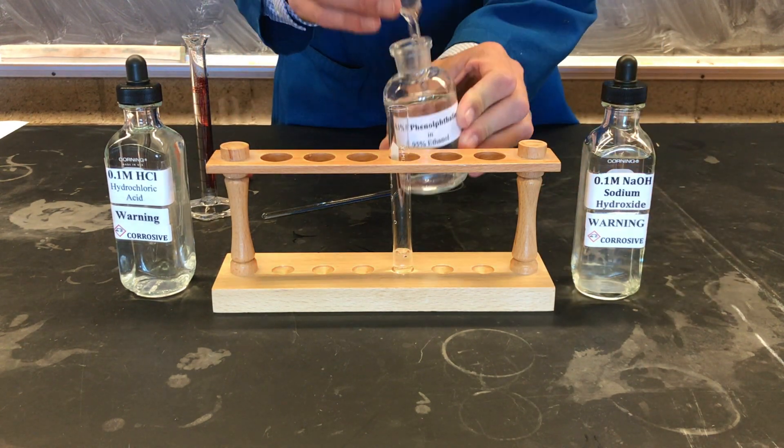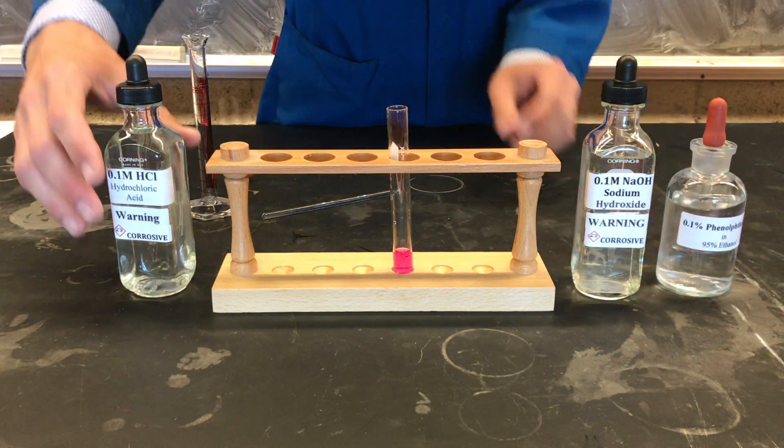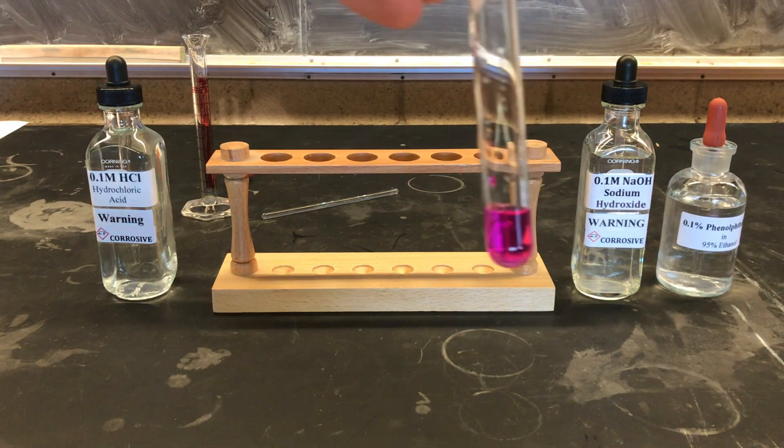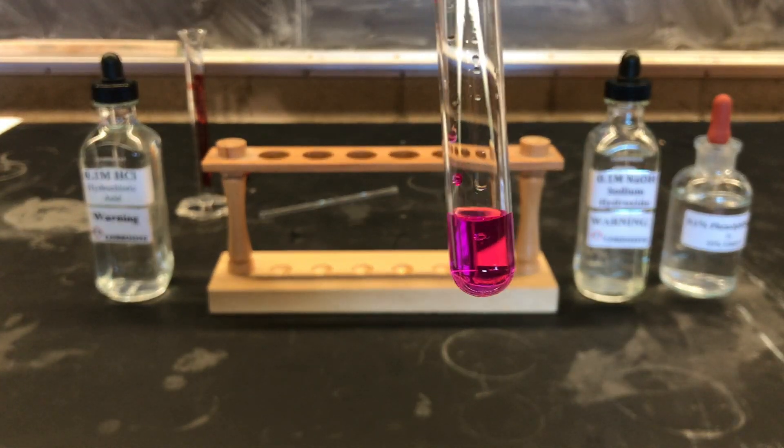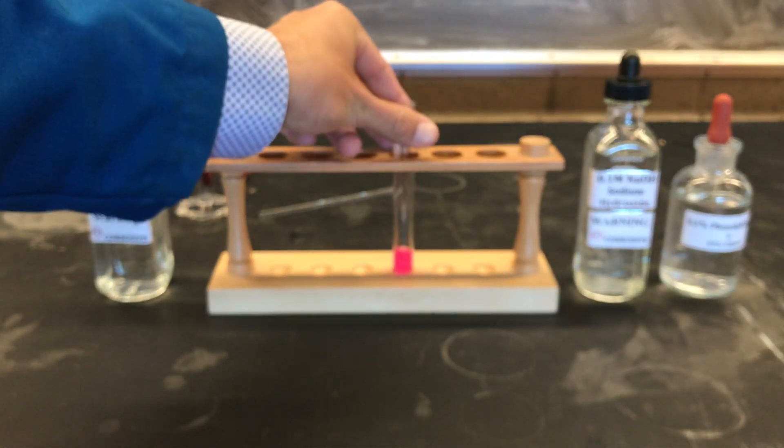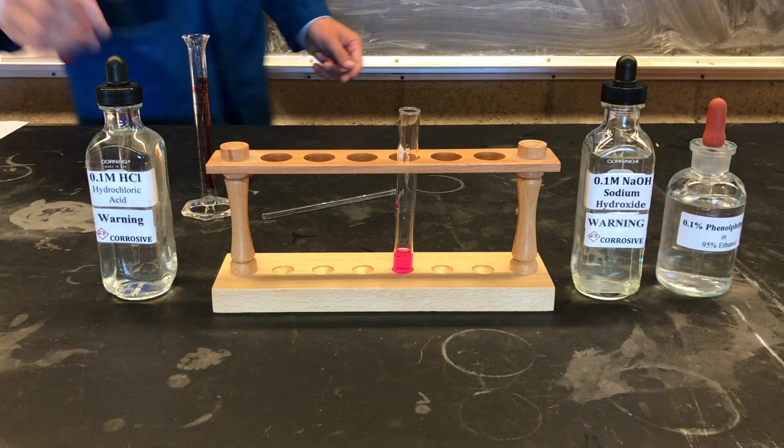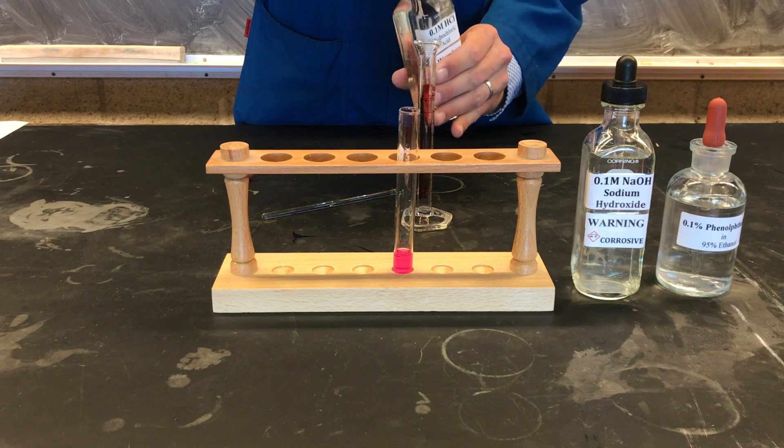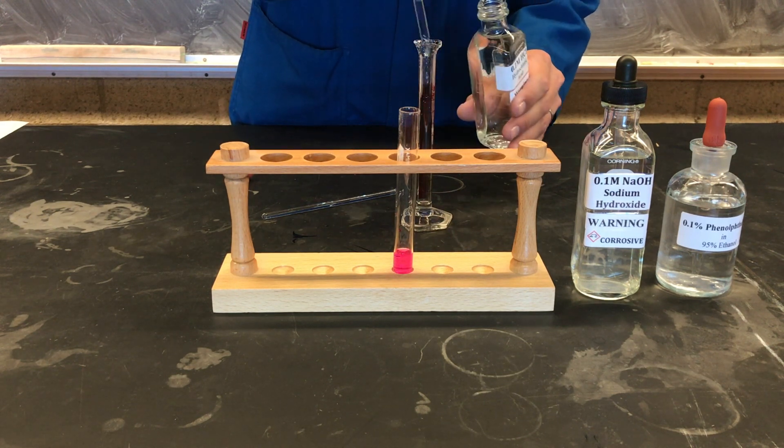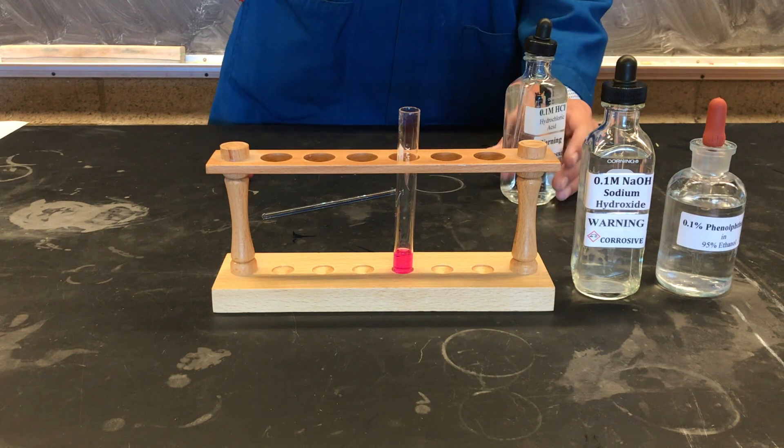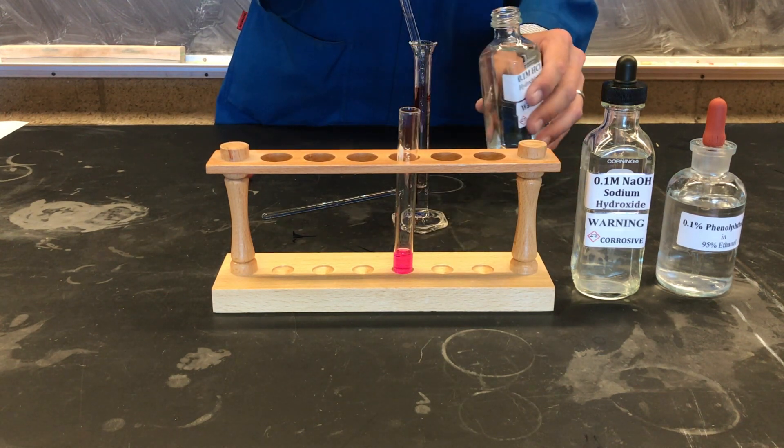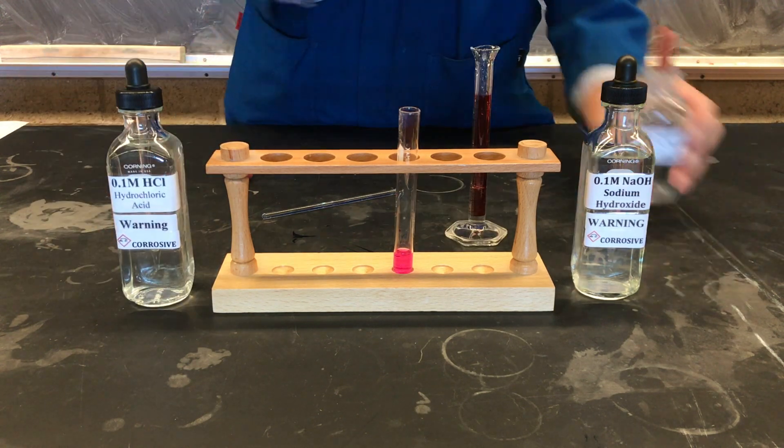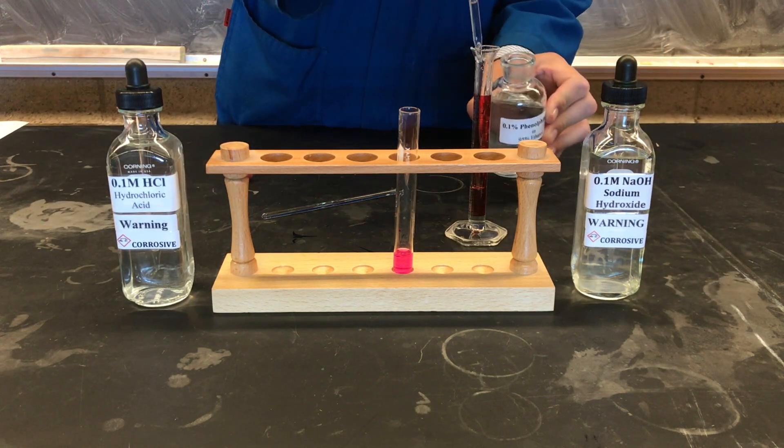We'll add 2 drops of our phenolphthalein indicator to our sodium hydroxide. After cleaning our graduated cylinder, we'll add about 3 ml of our hydrochloric acid solution and again add 2 drops of our phenolphthalein indicator.